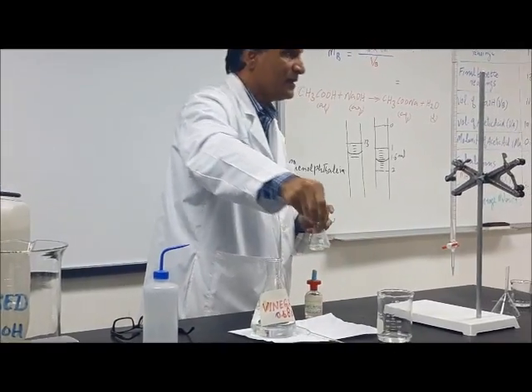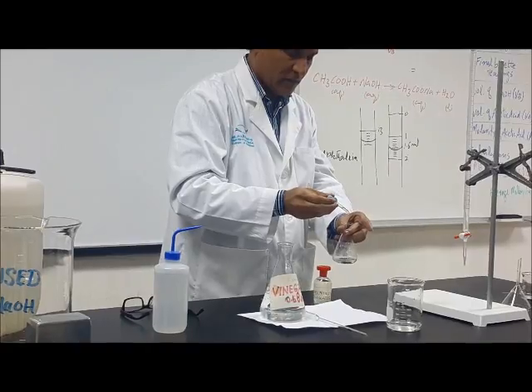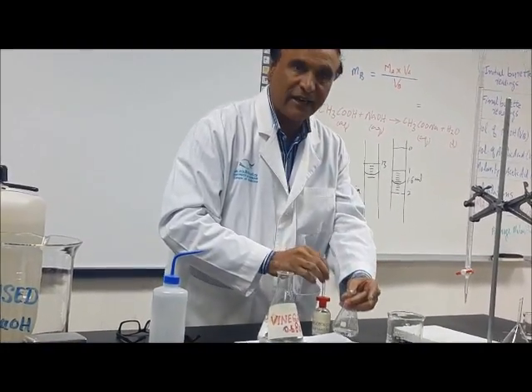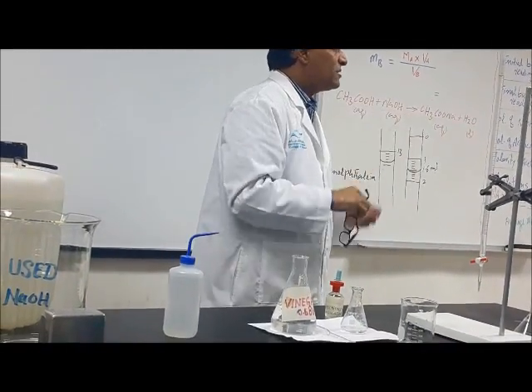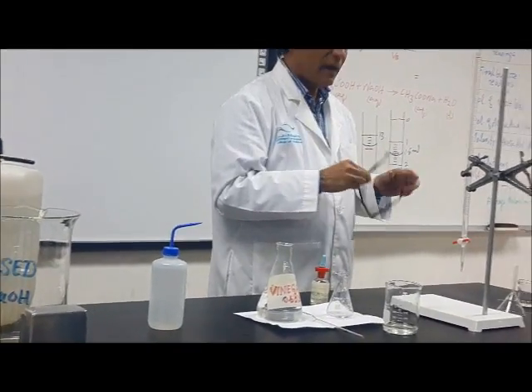What to do next? Indicator. How much? 1, 3 or 2, 4? 3 or 4. Okay. This is ready. What to do now? Take the initial reading. You can start from any place.